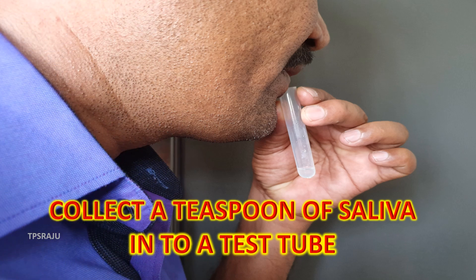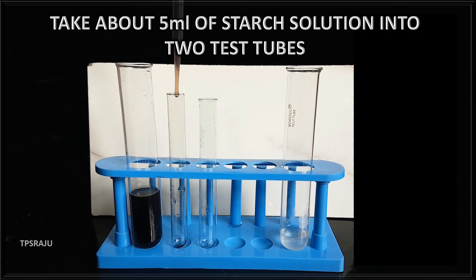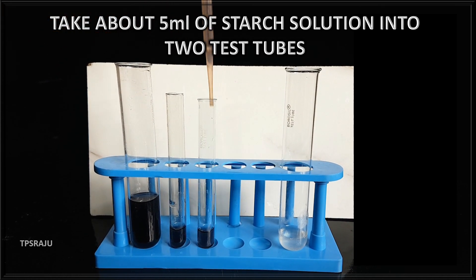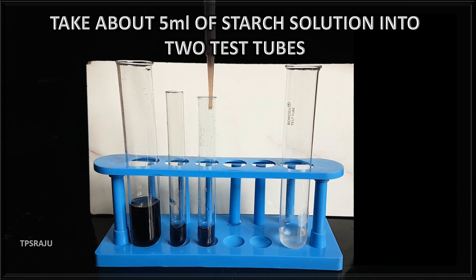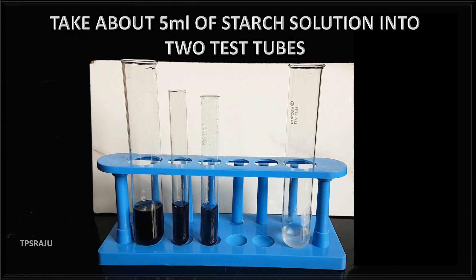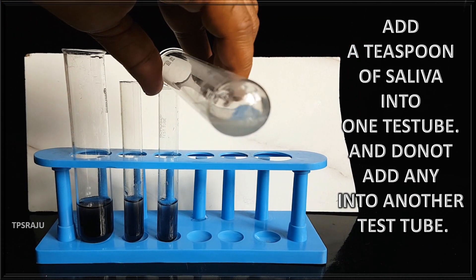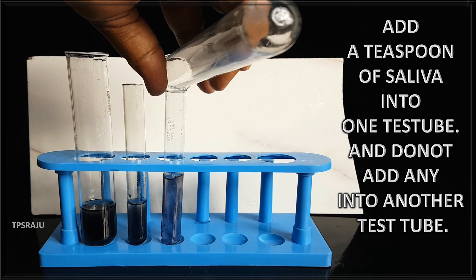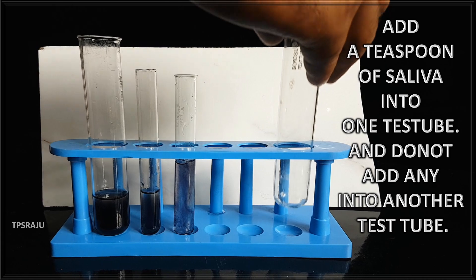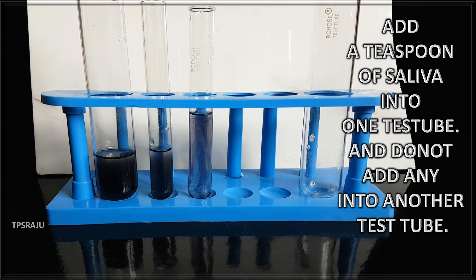Next, collect a teaspoon of saliva into a test tube. Take two clean test tubes and add 5 ml of starch solution into both. Add a teaspoon of saliva into one test tube, and do not add anything into the other. Leave them for a few minutes and observe carefully.